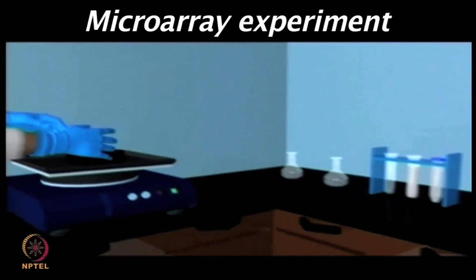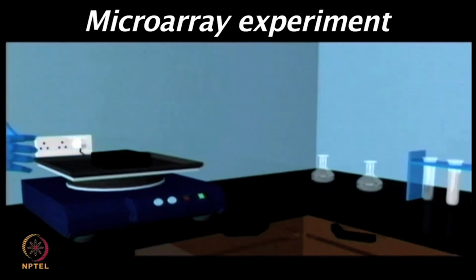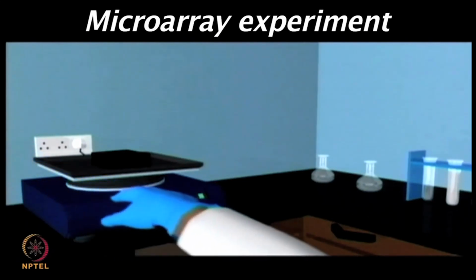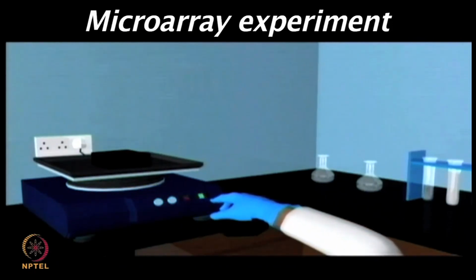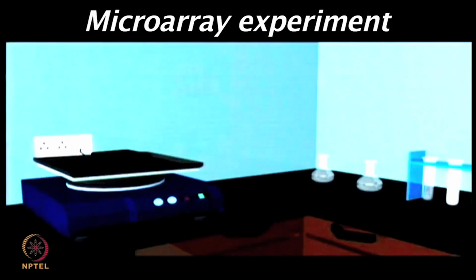One needs to ensure proper shaking while performing the blocking experiment. You do not want the milk or the blocking reagents to dry on the chip surface. So, it has to be very uniform and gentle shaking.